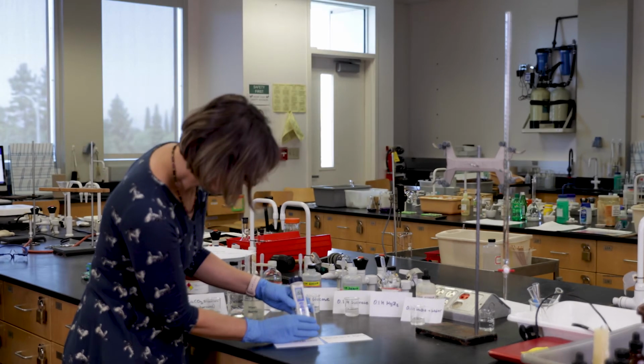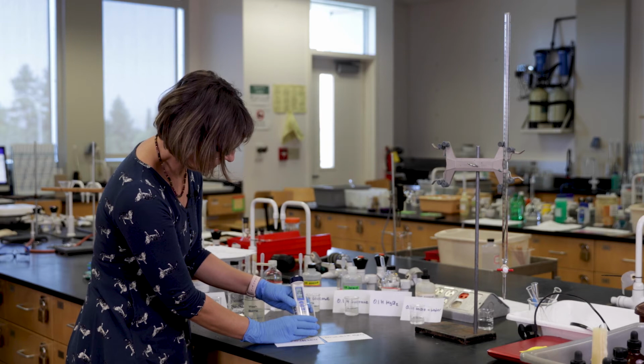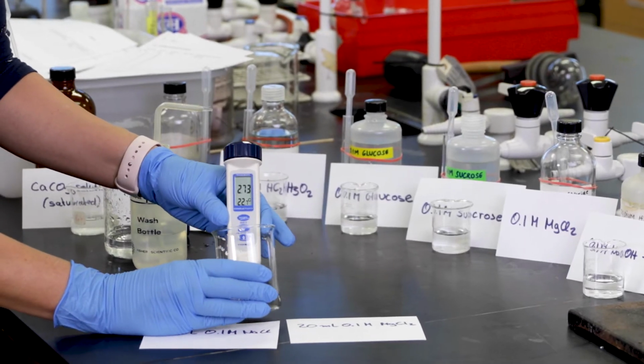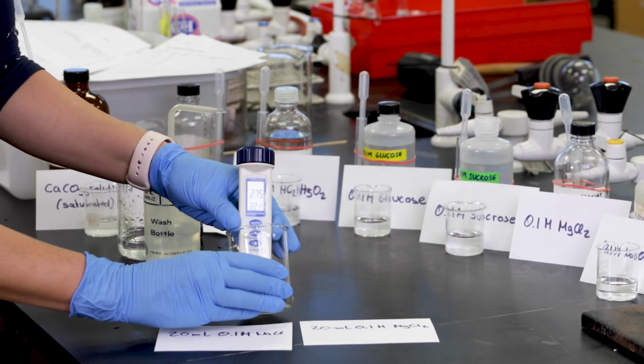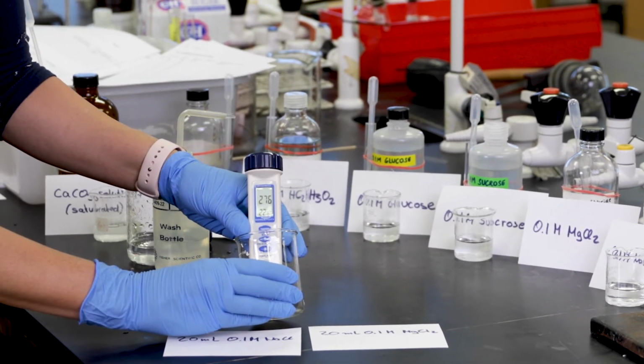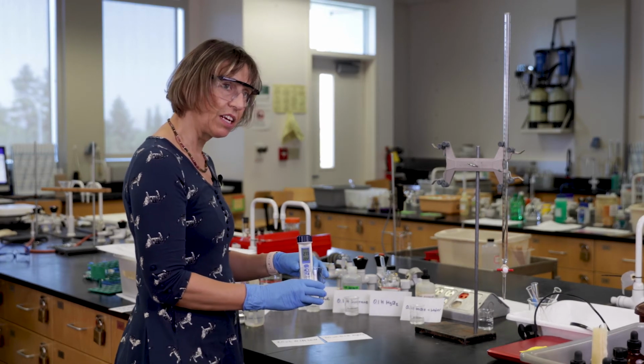Stir it a little bit. 2.71 millisiemens. So far we have added 30 milliliters of water.